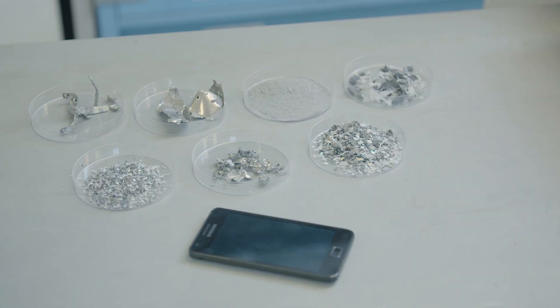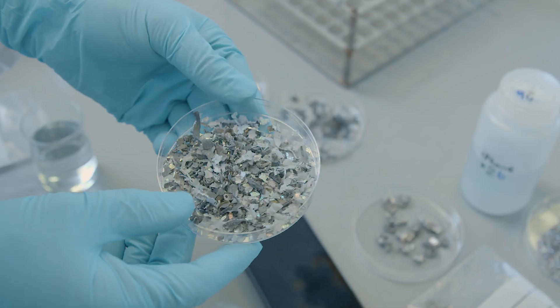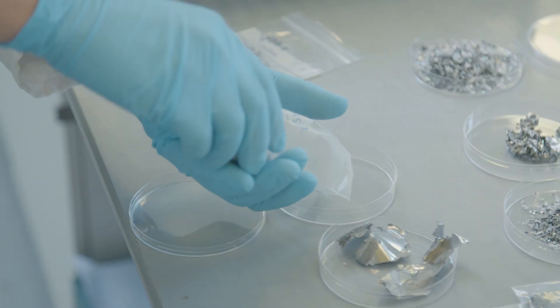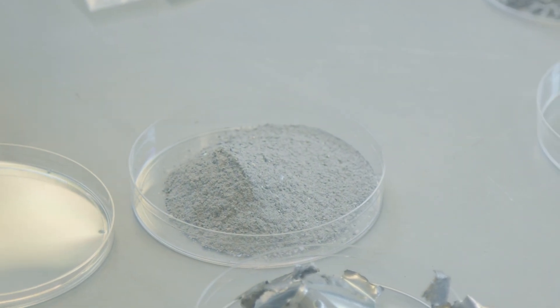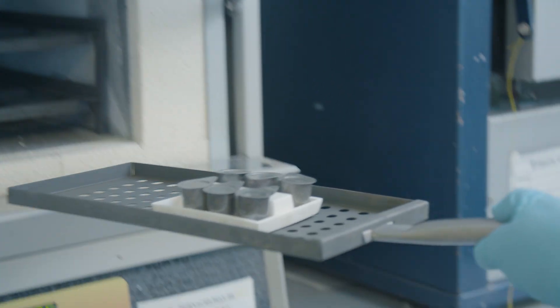This is our phone. This is what we got when we put that in the blender and I separated it into different fractions. There's some coarse bits here, some bits of plastic here. What we're interested in today is actually this powder, the very fine powder, and that's what I've put in the crucibles and in the oven behind me. So let's see what we've got.